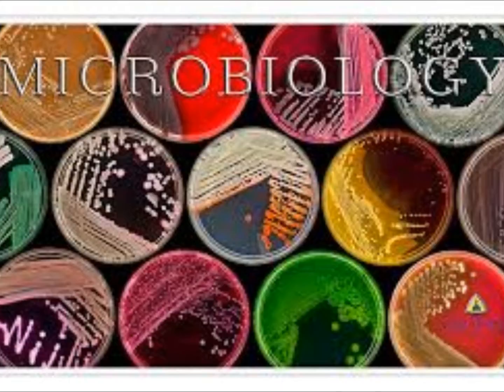And another purpose of the identifying characteristics is if you have a culture that has multiple organisms in it, and you're working up this culture on the first day, you need to give a good enough description of each one of the different colony types on that media, because tomorrow, it could be a different person looking at that plate.